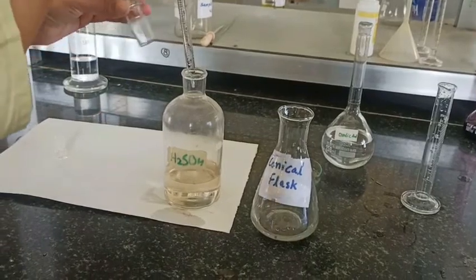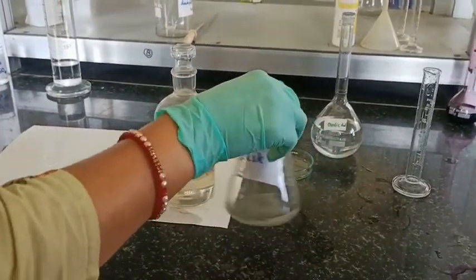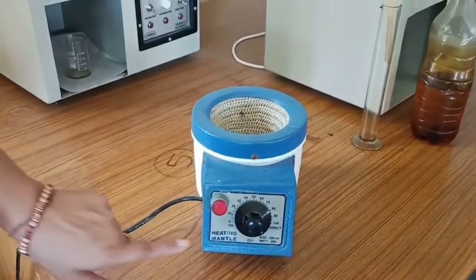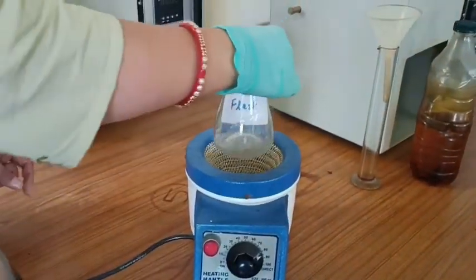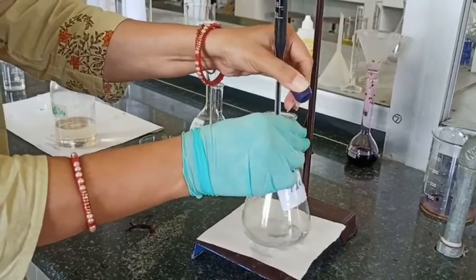So the question is why we are adding this to the oxalic acid, and now I am going to heat this solution. This is the heating mantle. I set the temperature up, and here you can see that it is warmed up. Now we will start the titration.